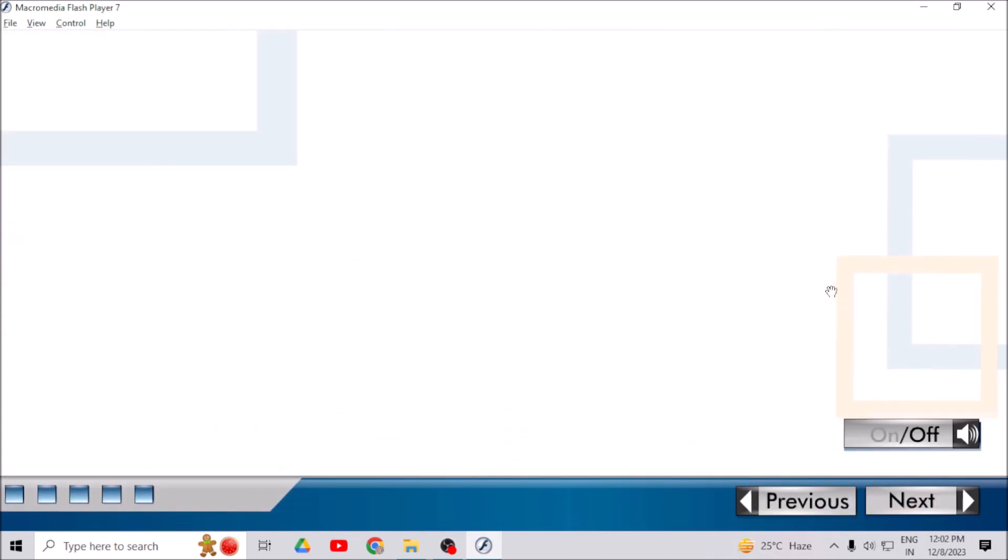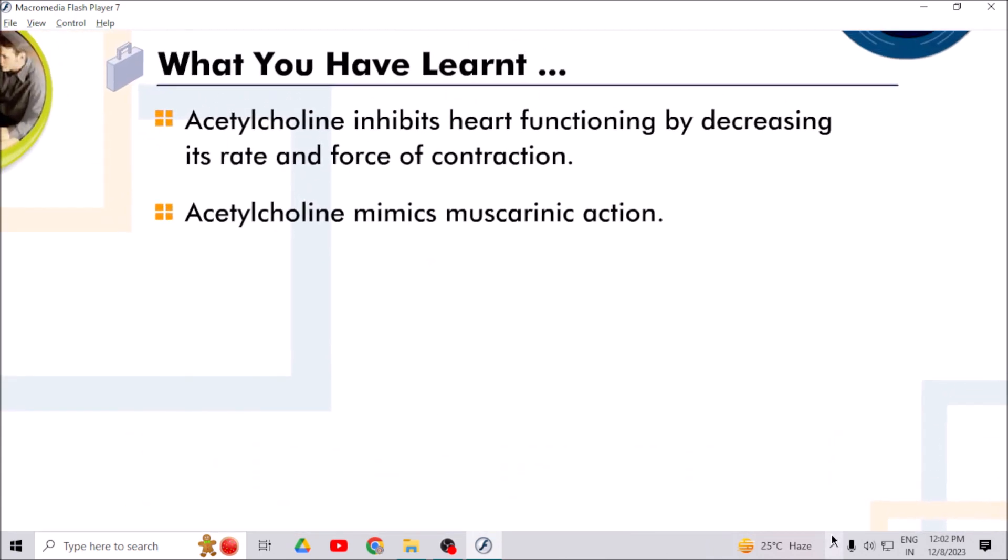You have learned that acetylcholine inhibits heart functioning by decreasing its rate and force of contraction. Acetylcholine mimics muscarinic action.